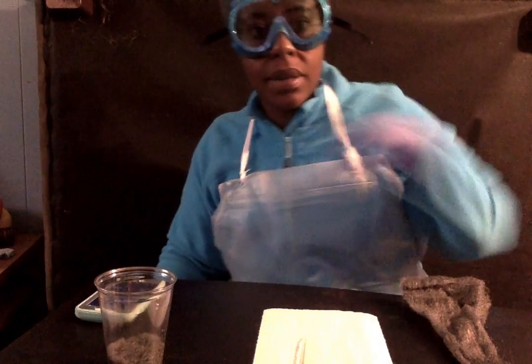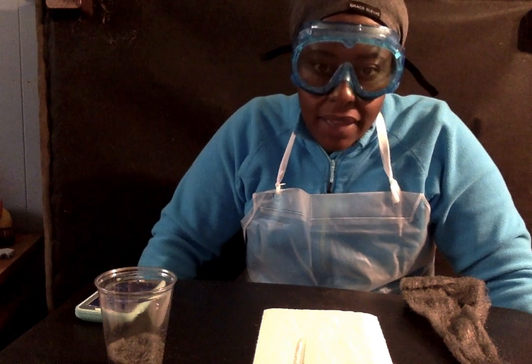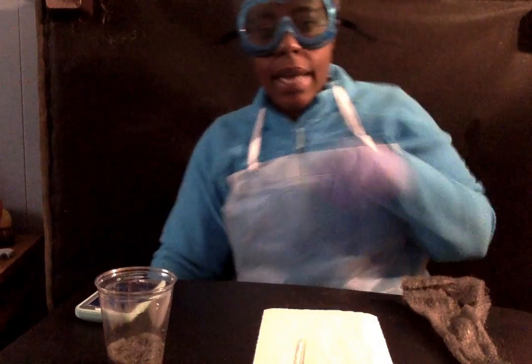Okay, so something interesting while we're waiting for that to happen, it says vinegar does not participate in the synthesis reaction. In this procedure, vinegar strips away the protective coating of the steel wool pad and provides an acidic environment that accelerates the subsequent chemical reaction. So our next step, after we have the 2 minutes, I'm just going to read it to you. We're not there just yet though. But we're going to remove the steel wool from the cup and carefully squeeze the excess vinegar back into the cup. It also notes that you should keep the small cup of vinegar to use in activity 4.